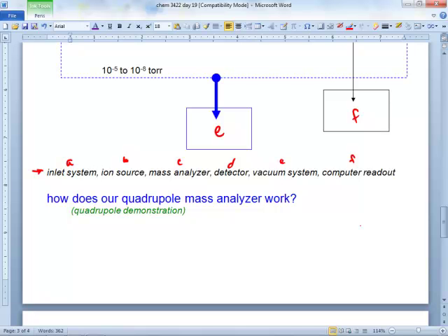Now the only thing that is going to make it through here? Light. So you guys are flying through here, right? All right. Send it through. Now only what's going to make it through? Light. Okay, it depends on which light she's set up to, right? Whether it's this one or that one, right? So give all the other ones to the vacuum system. If it's not going to make it through there, they have to give them to the vacuum system.